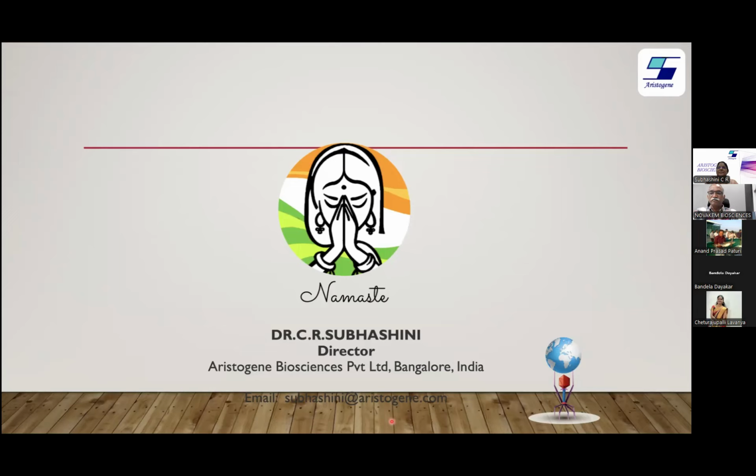Is there any specific media for isolation of bacteriophages? Media for bacteriophages? No. Bacteriophages cannot grow on any media. They grow only inside a bacteria. So first you have to grow a bacteria and then grow the bacteriophages inside the bacteria. So there is no specific media for bacteriophages. Whatever media in which a bacteria grows, the phage will grow inside that.